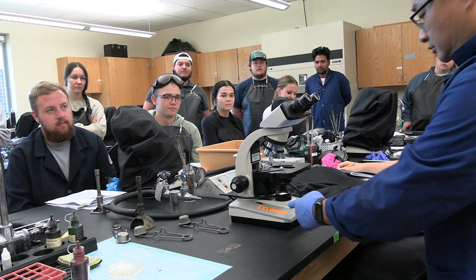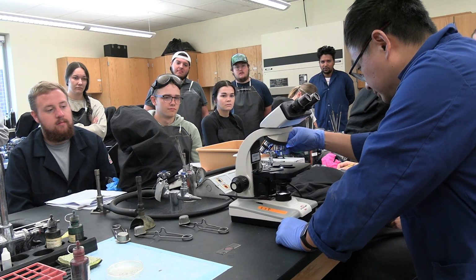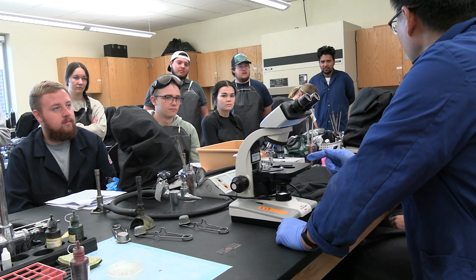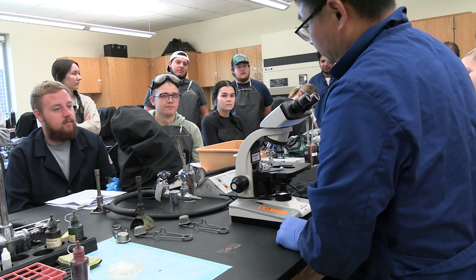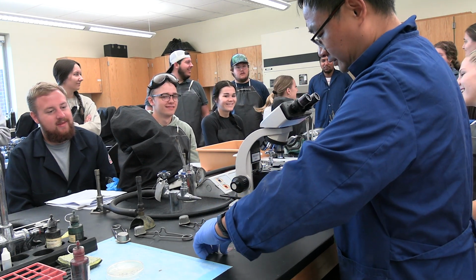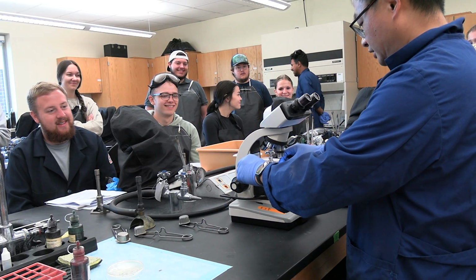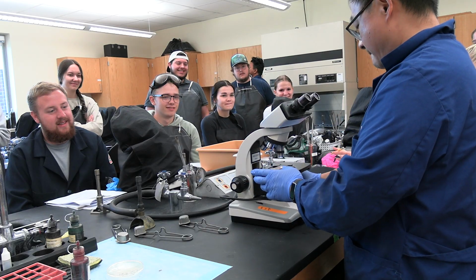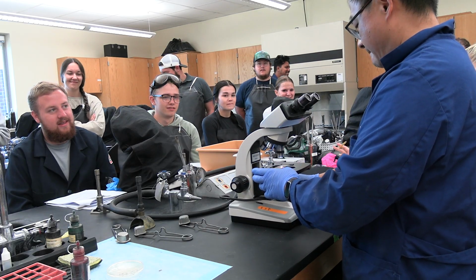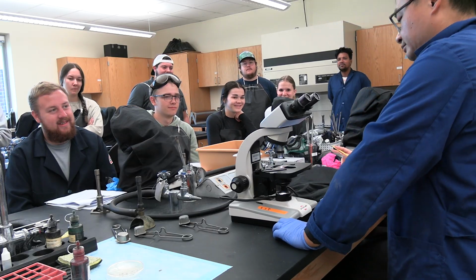Turn it on. Somebody said the 100 lens is damaged. I don't know. What's damaged? This 100 doesn't work? This one? Yeah, it has fungus inside. Let me try first though. Maybe it works. Okay, no worse. If not working well, I can change. Okay, alright. So how we do it?